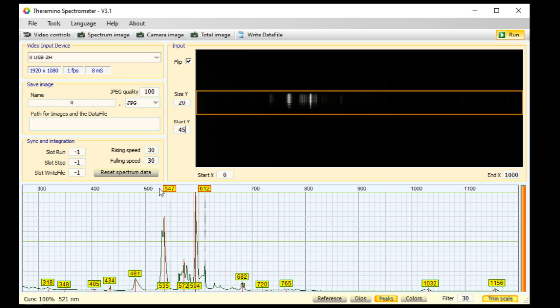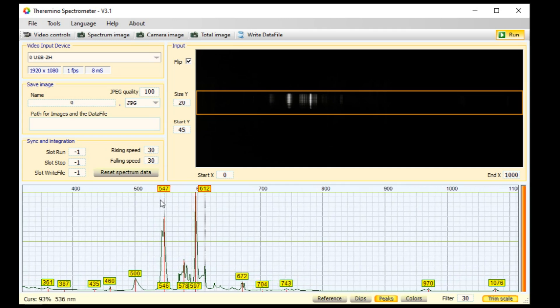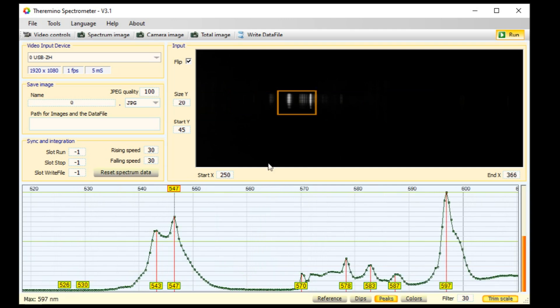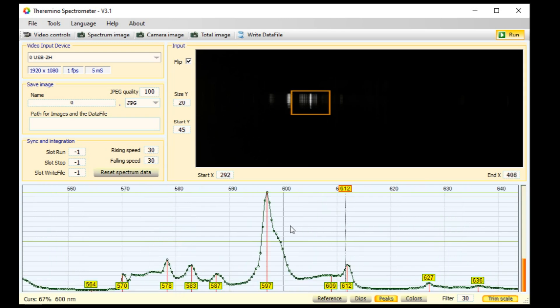Now you'll see 547 and 612 at the top. Make sure peaks is also yellow and dips is off. Drag the 547 to that right-side taller mercury peak in that double emission line. I'm going to zoom in by putting the mouse over that peak and scrolling the mouse scroll wheel. Notice that as you scroll, the orange box above also zooms in. The peak number at the bottom should match the trim point number at the top — these trim points are your calibration points.